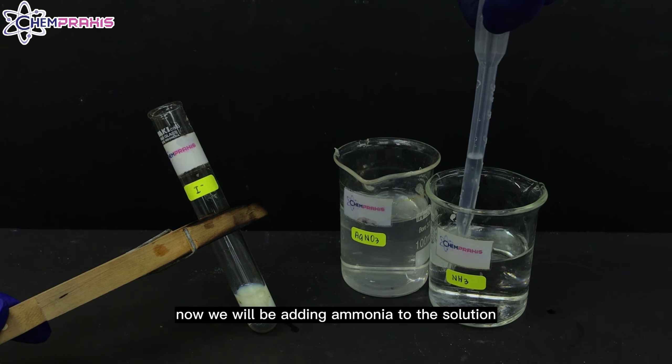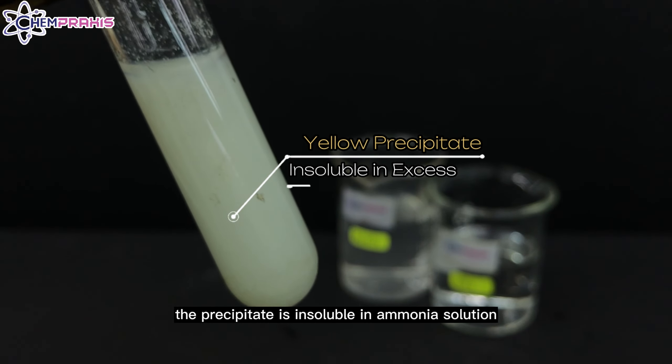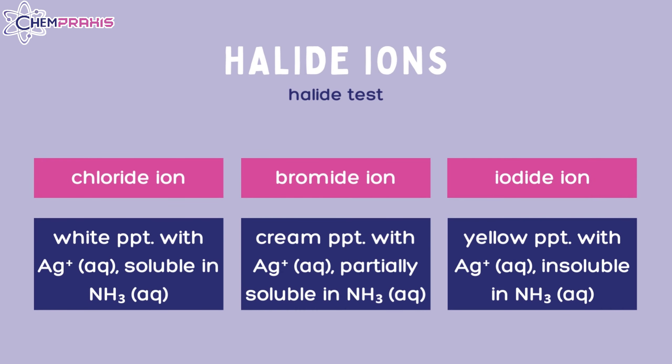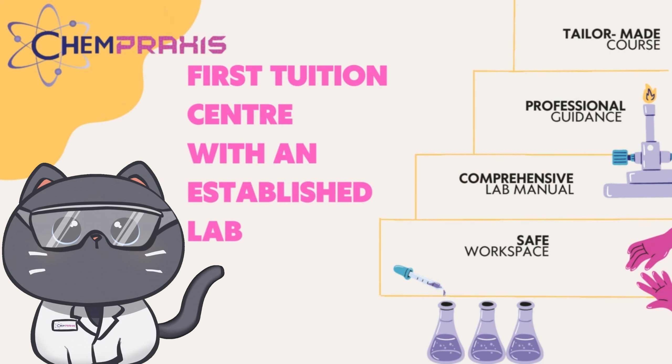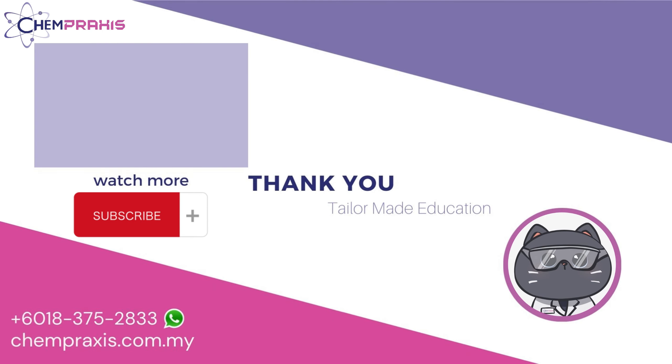Now, we will be adding ammonia to the solution. The silver iodide precipitate is insoluble in ammonia solution.